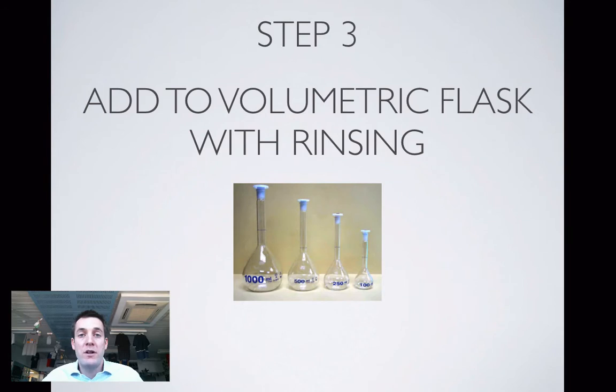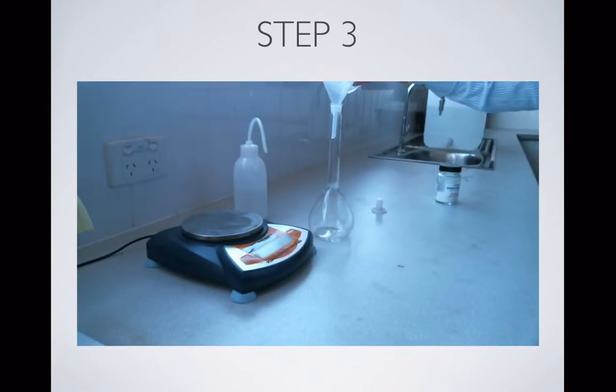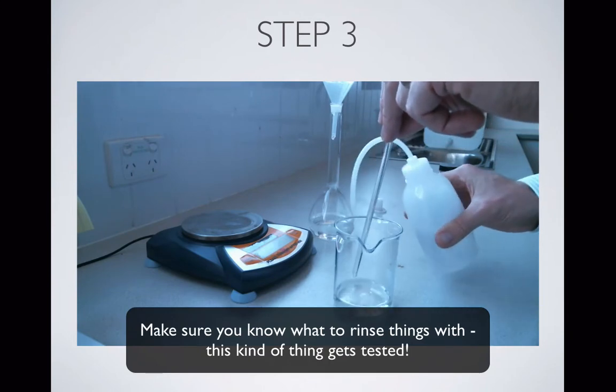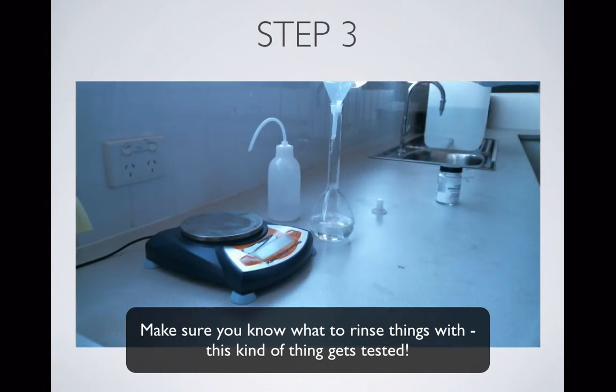And then we're going to transfer our solution to a volumetric flask with rinsing. We're going to make sure that our equipment is thoroughly rinsed so that every single last bit of the solid that we weighed out ends up in the volumetric flask. I'm just going to use a funnel in the volumetric flask to make it a little bit harder to spill the solution everywhere. It's worth noting that this volumetric flask ought to have been rinsed with distilled water before we do this. You wouldn't rinse it with a solution of the sodium carbonate, because that's going to change the concentration of the sodium carbonate that you're putting in, but rinsing it with distilled water isn't going to do any harm.